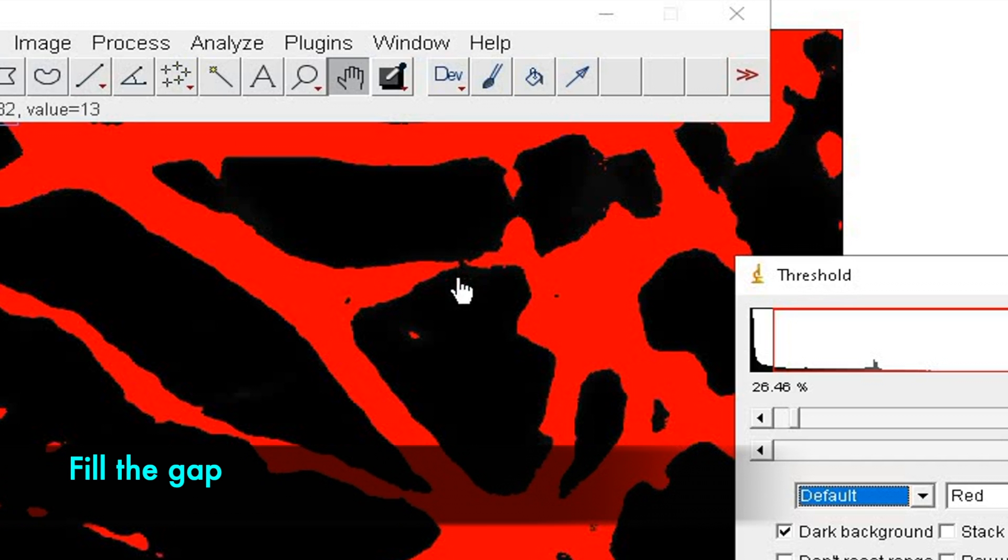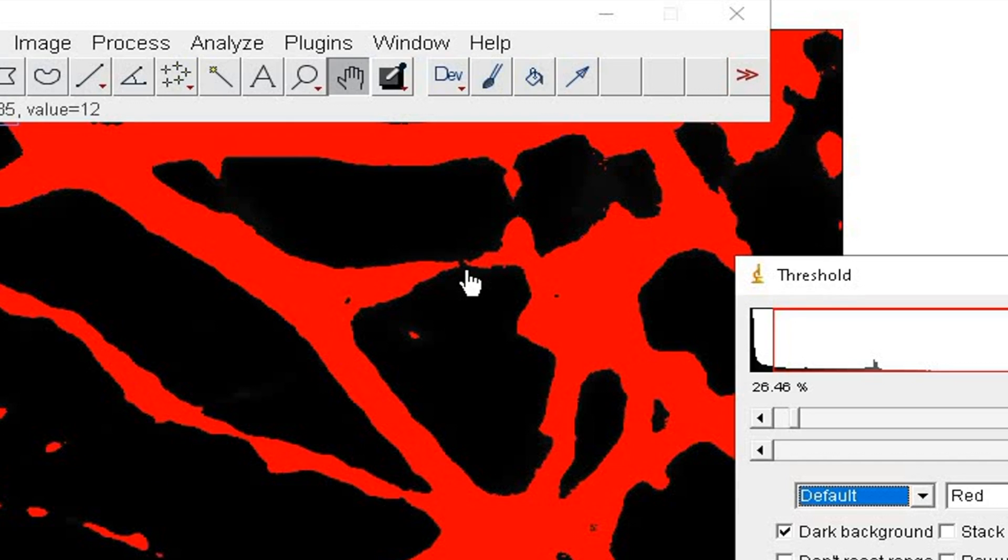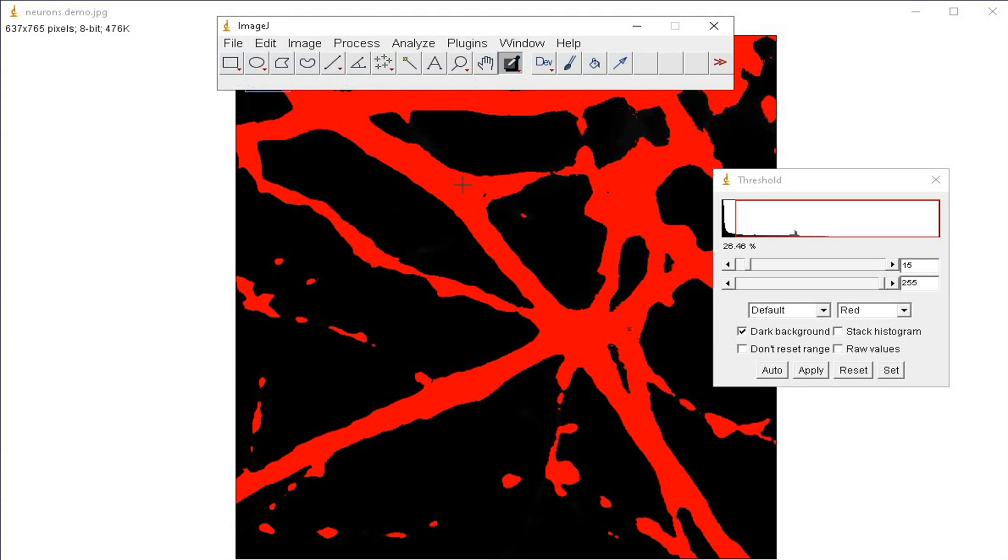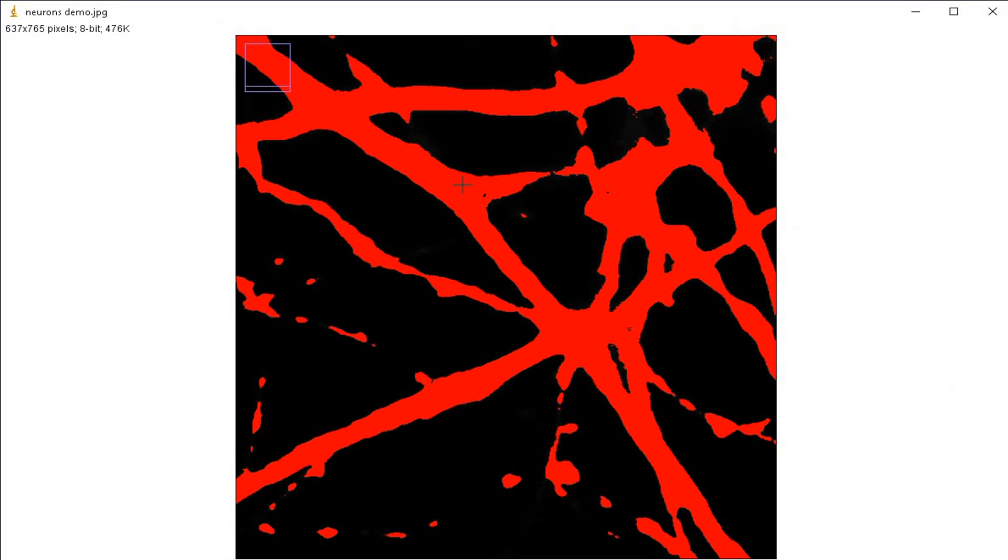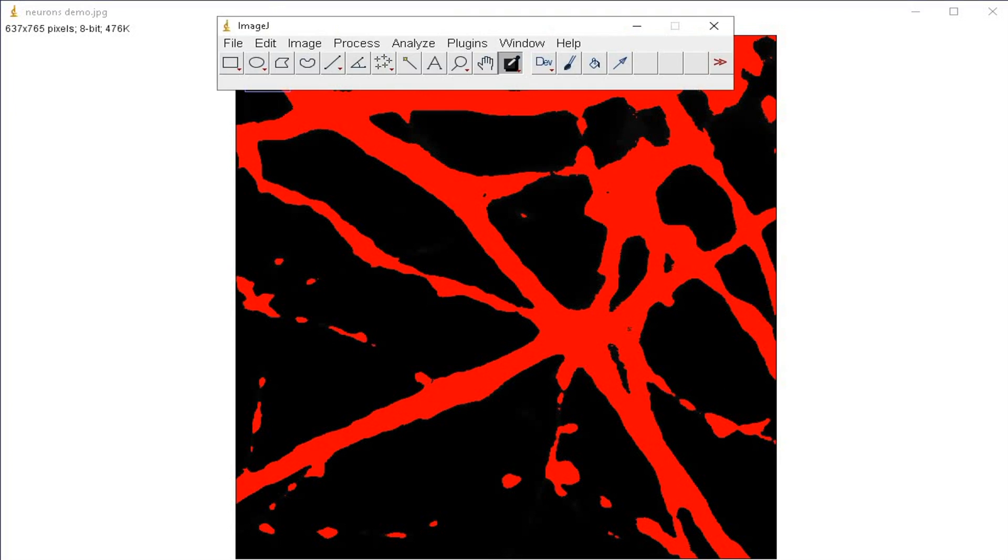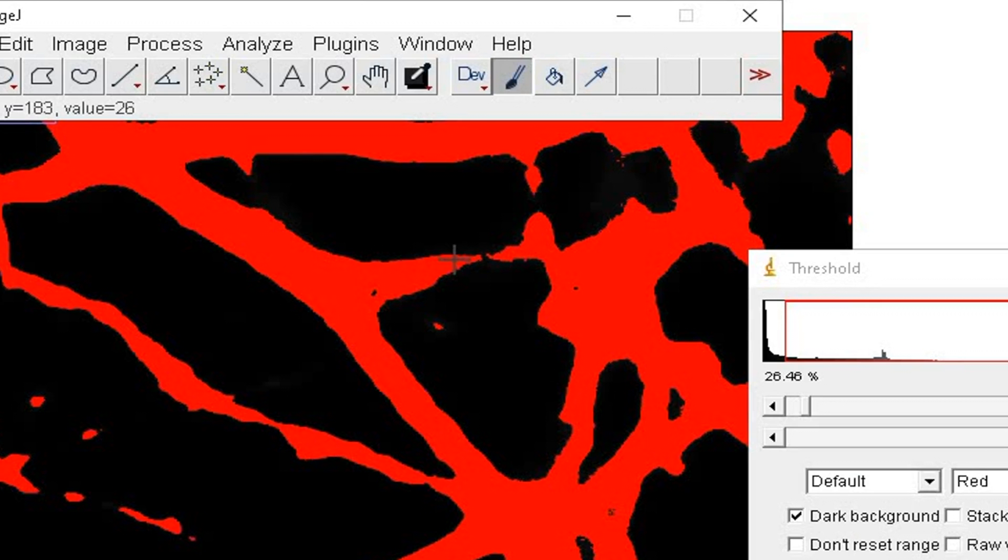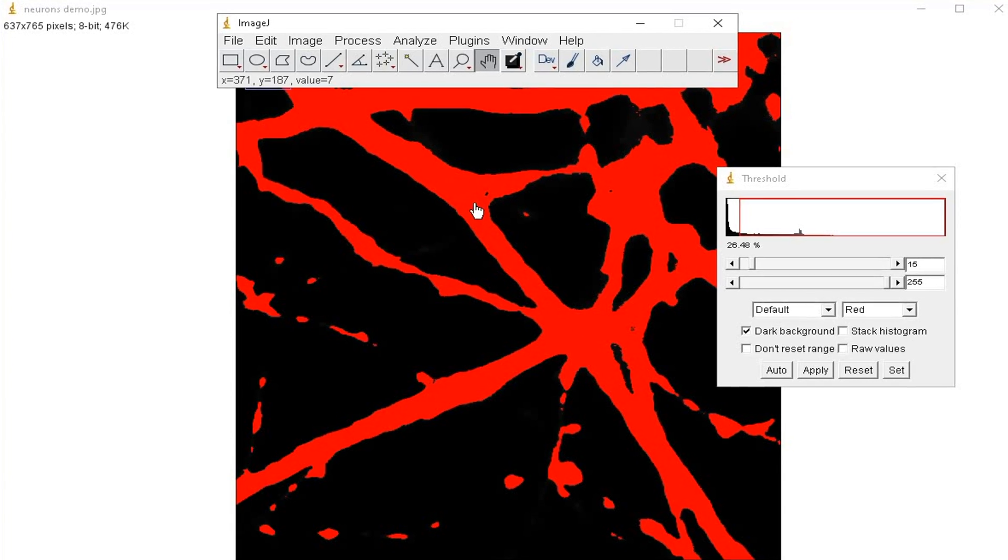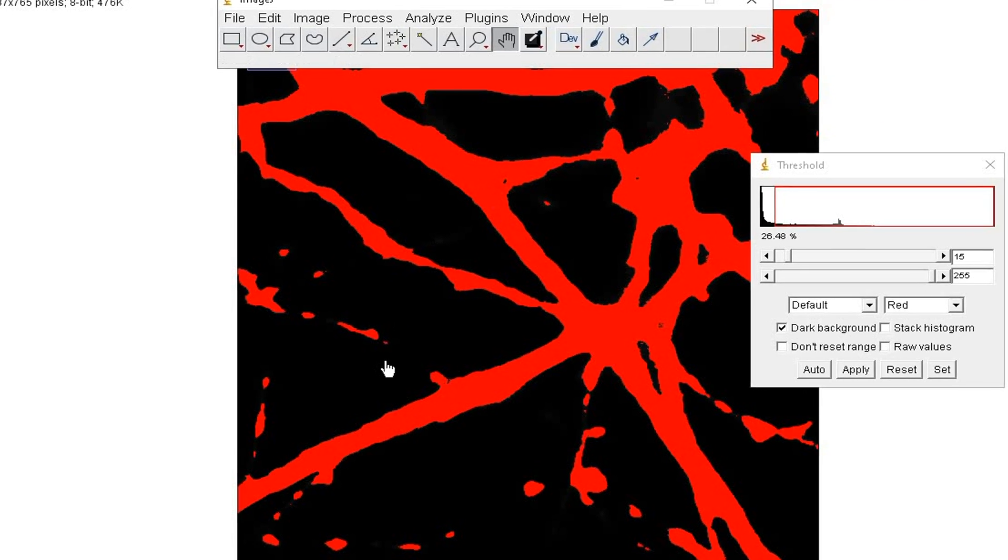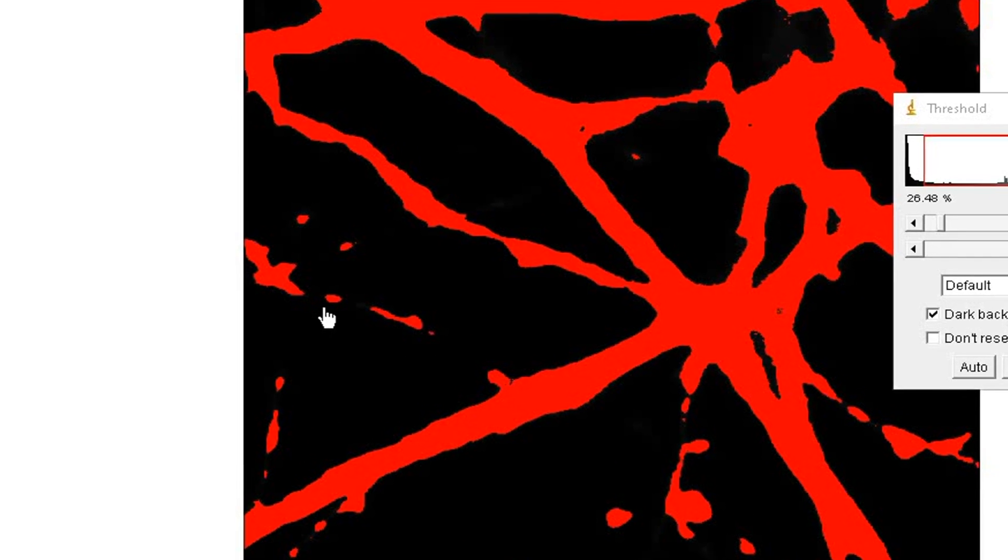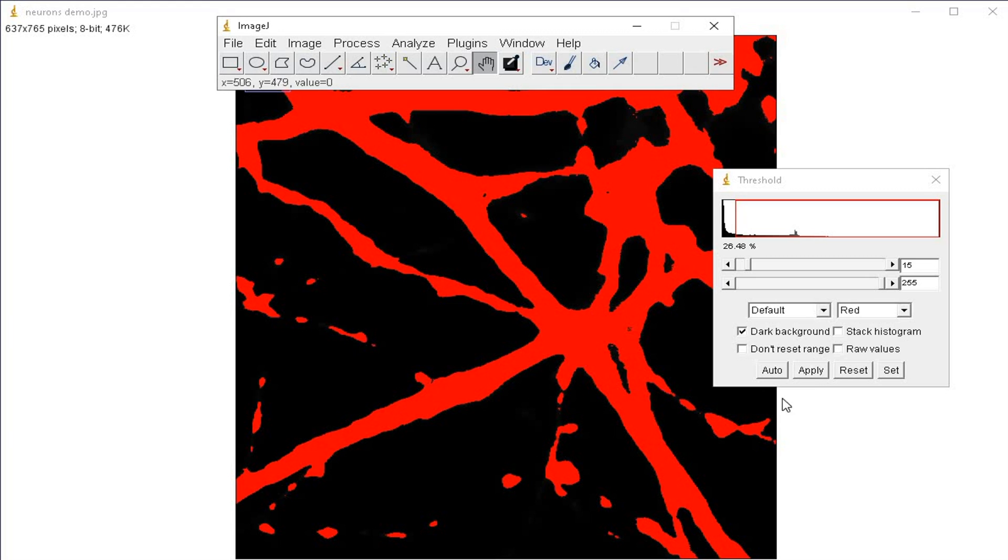You can also manually fill the gap by drawing a line to join the broken ends. Using the color picker, click on the red colored branch and select the paintbrush tool from above. Use the brush tool to draw a line connecting the branches. Let us leave this particular neuron branch disconnected to see the outcome later.